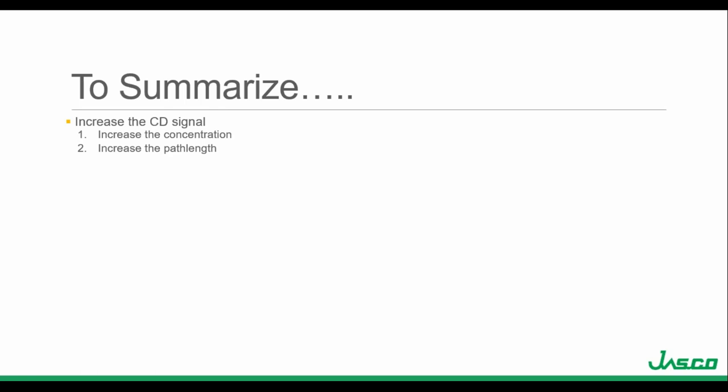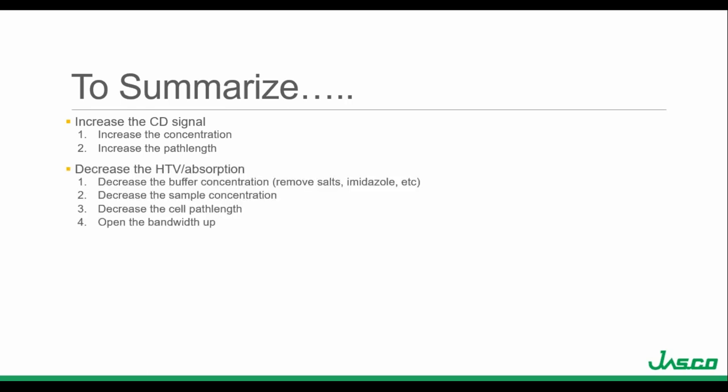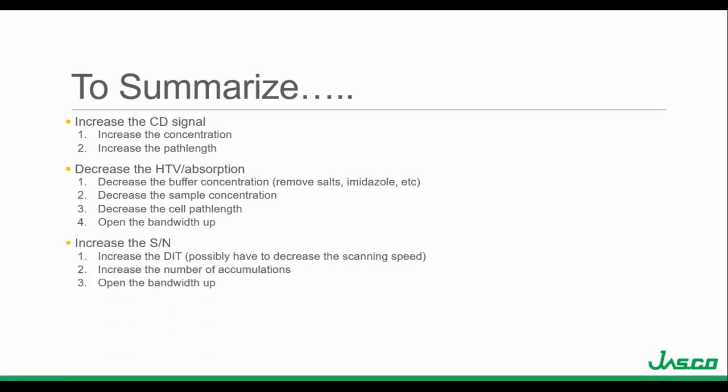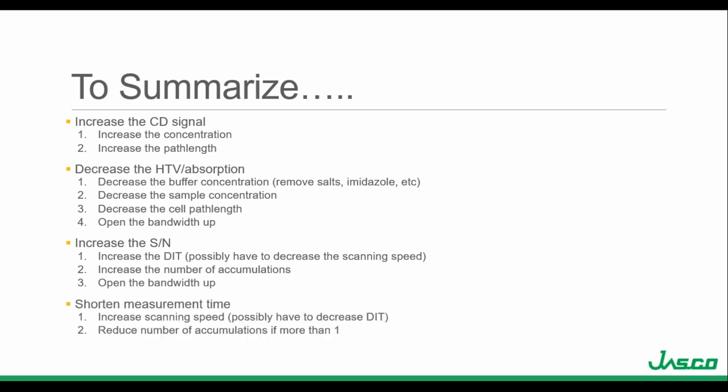To summarize: to increase the CD signal, increase the protein or sample concentration or increase the path length. To decrease the HT voltage or absorption, decrease the buffer concentration and remove any salts, decrease the sample concentration, decrease the cell path length, or open the bandwidth. To increase the signal to noise, increase the DIT — which may mean decreasing the scanning speed — increase the number of accumulations, or open the bandwidth. To shorten the measurement time, increase the scanning speed — which may mean decreasing the DIT — or reduce the number of accumulations.